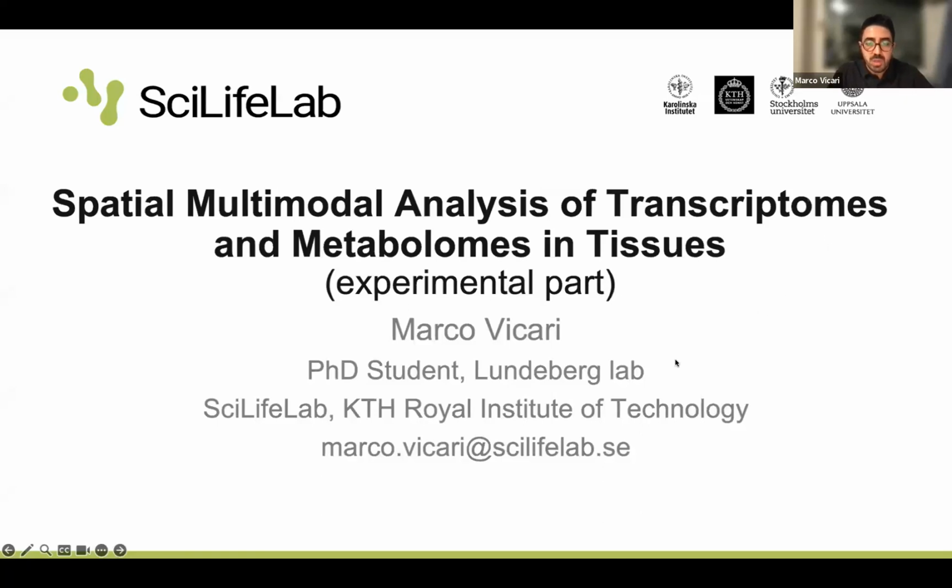Okay, so as Peggy said, we will present our work that is named Spatial Multimodal Analysis of Transcriptomes and Metabolomes in Tissues. I will focus on the experimental part and especially on the spatial transcriptomics part, whereas Patrick will focus on the multi-MSI part.